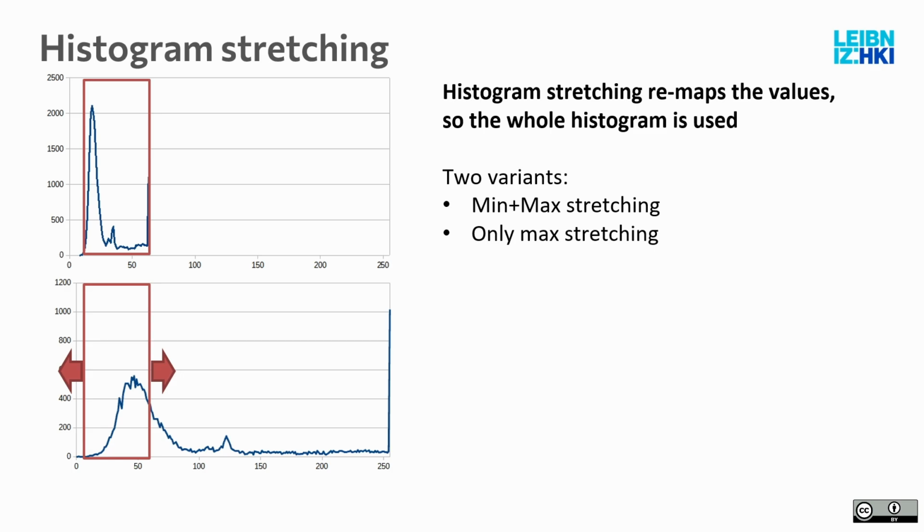You basically literally take that and, like in Office, when you stretch something larger, you stretch it. There are two variants of it, min and max stretching. Basically, you would shift the 8 here to 0, drag it from the left, and also do it to the right, so we max out the full value range.